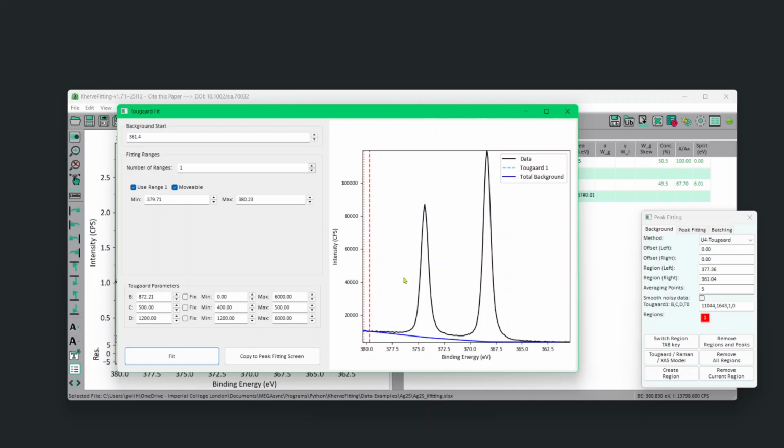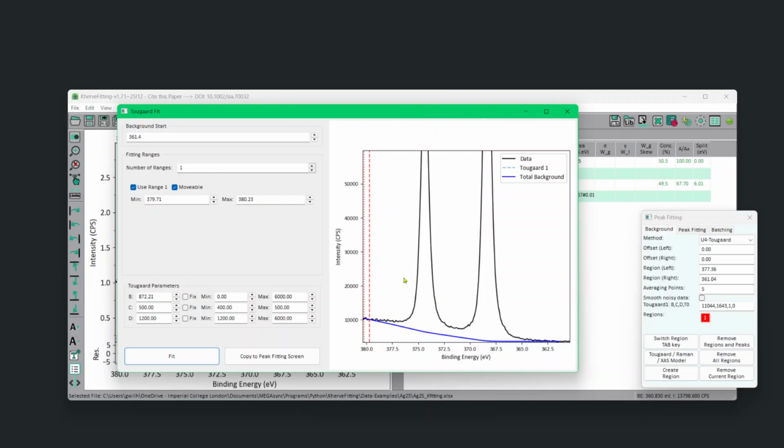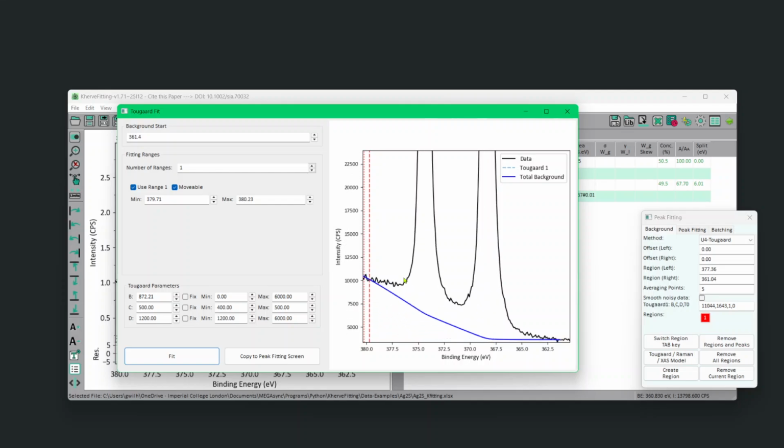You can also use Control Down, and you can then see what you have. So here you have a standard way where the background is increasing by the middle of the peak, and then you have a second increase in here. So this will be changed especially by using the C parameter. And the B parameter is the one that was fitting using this range.